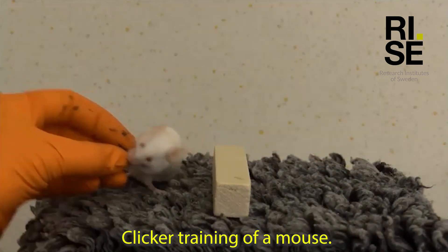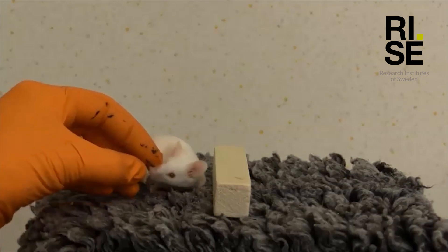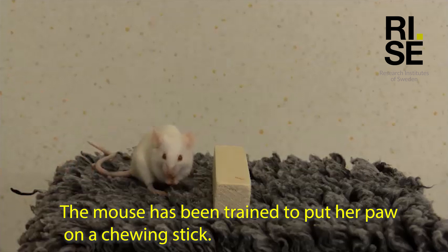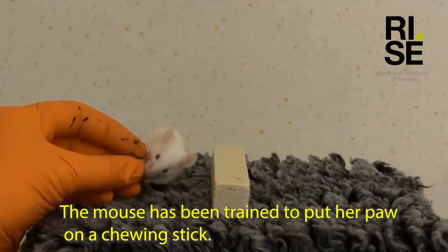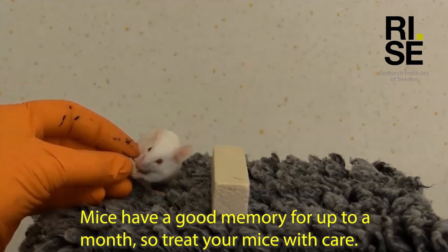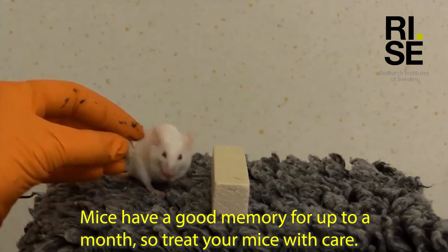Clicker training of a mouse. The mouse has been trained to put a paw on a chewing stick. Mice have good memory for up to a month. So treat your mice with care.